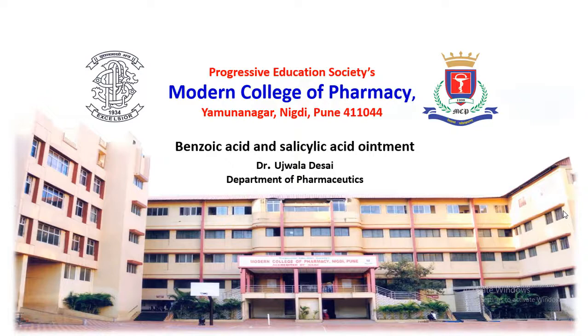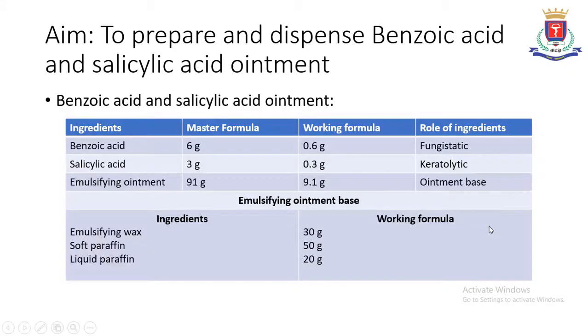So today we will see the formulation of benzoic acid and salicylic acid ointment. This formulation is also called compound benzoic acid ointment. Now here you can see the formula, that is, the composition of benzoic acid and salicylic acid ointment.